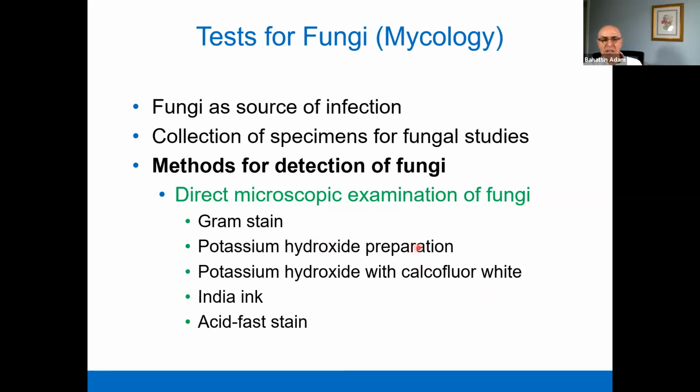Gram stain techniques, potassium hydroxide preparation, India ink, acid fast stain, those are some techniques that we are using to identify fungi via direct microscopic examination. As I said, these are the most common techniques and really easier to perform.